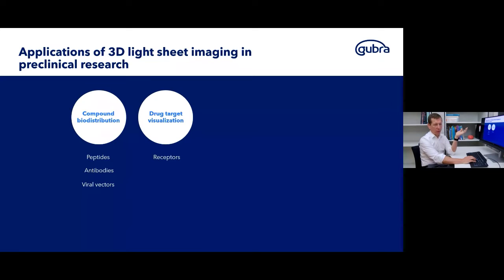The second question that we commonly answer is drug target visualization. So, for instance, looking at where a receptor is localized, in which cell types, and this can actually complement the first question of compound biodistribution.